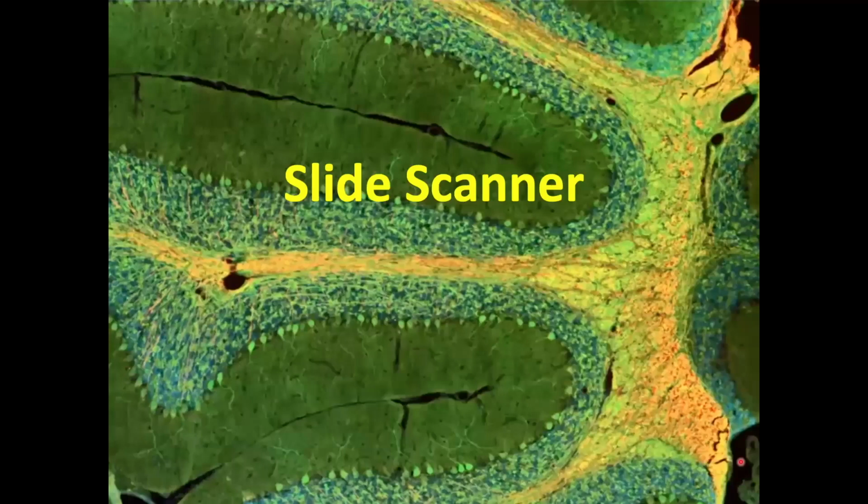The next approach that we're going to look at is the slide scanner. This again is very much a fixed sample approach. So in this case, we would be taking either the paraffin or cryopreservation approach of fixing, embedding, and sectioning onto slides.